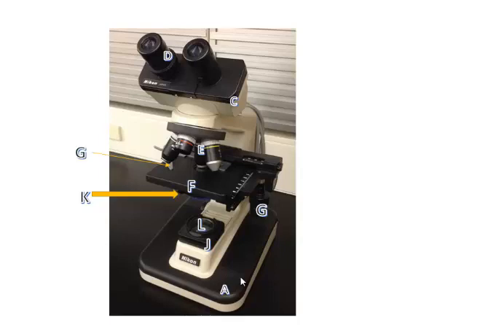So again, review these parts. There's a practice quiz that you can take, and there's also a worksheet that you can fill out showing that you can identify the parts of the microscope, and also make sure that you're familiar with the functions of those parts.